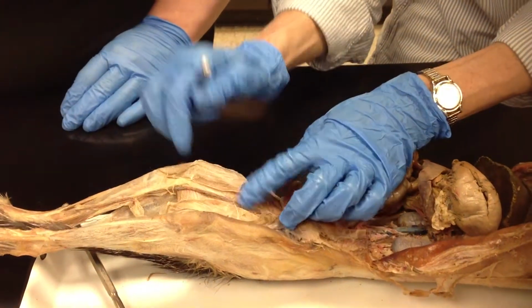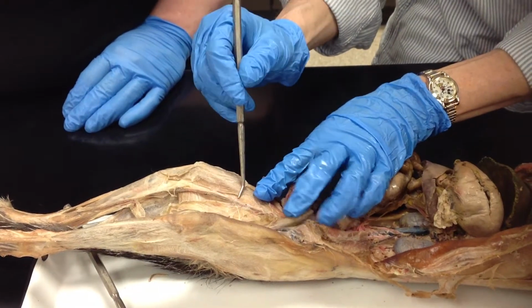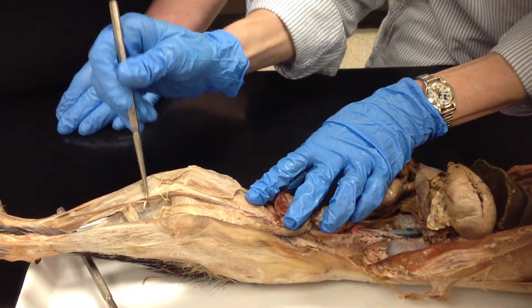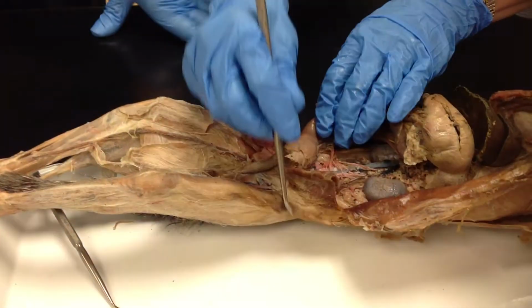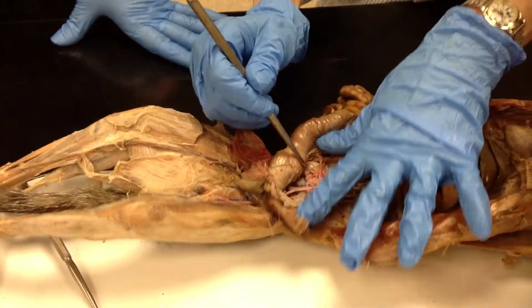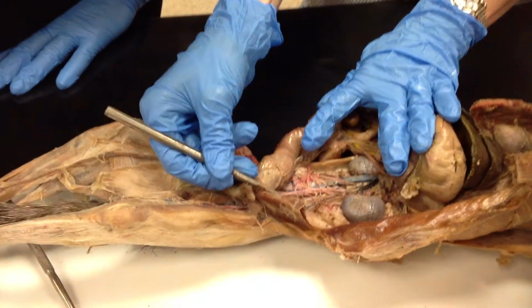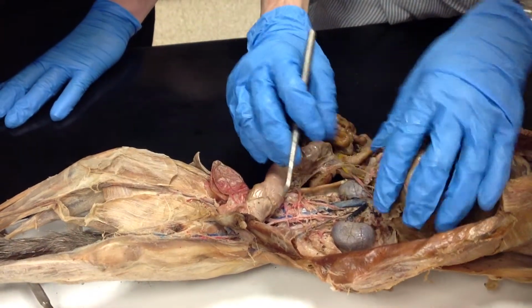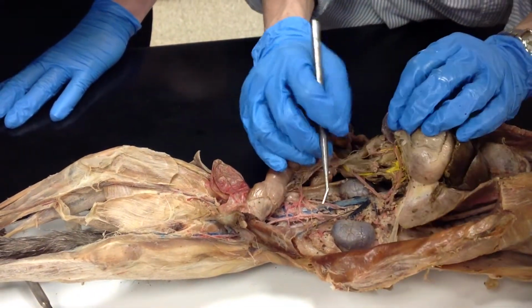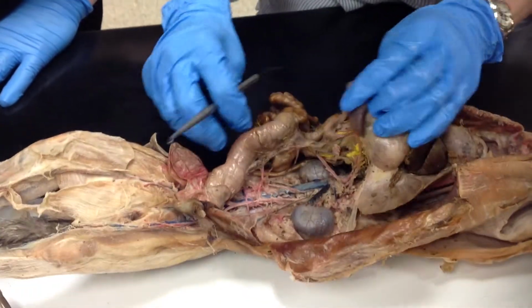Is this the vein? No idea. Can you see your lumbar? Oh, here. Here's your iliolumbar artery and vein right here, red and blue. You can see those. Mesentery ones. I have no idea where the veins went.